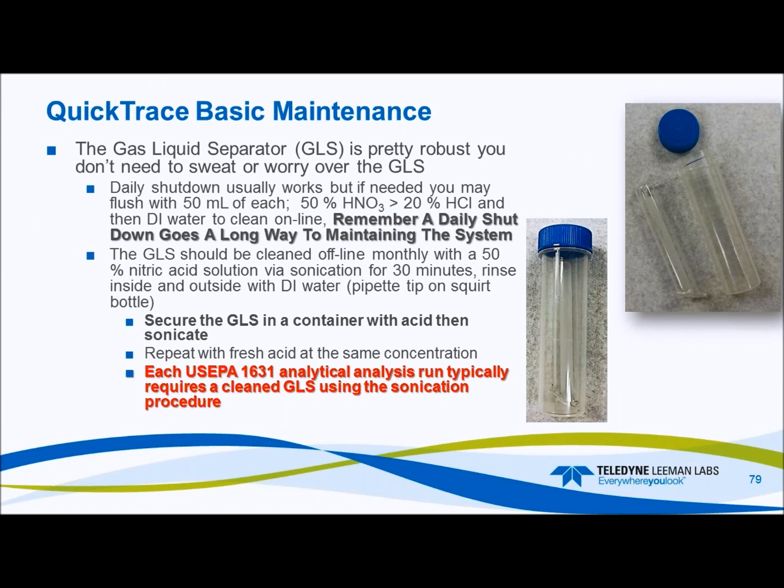Other metal departments like the ICP-MS, ICP-OES and so forth, I'm not picking on those people, but they should not use anything that's deemed mercury. So if you label it, keep it in control, keep it with your method for mercury analysis, and it'll produce a lot less headaches.